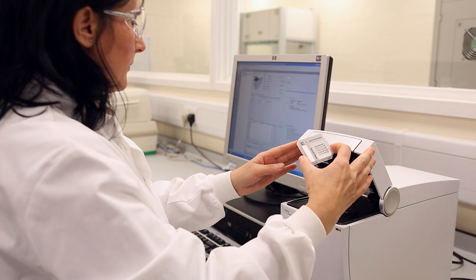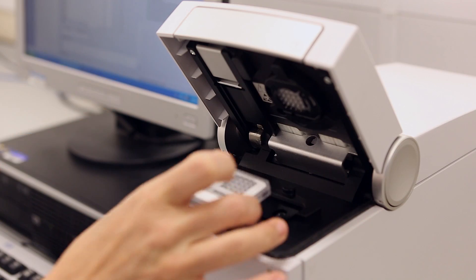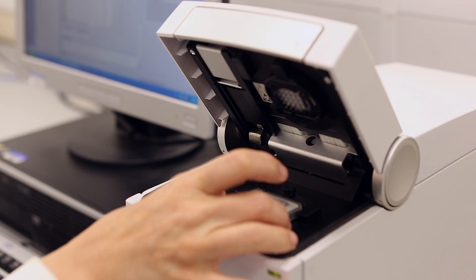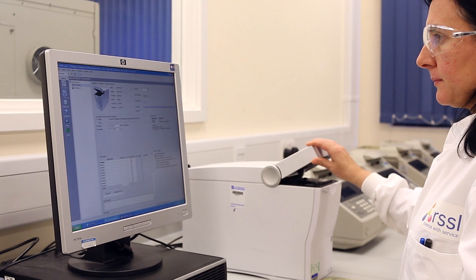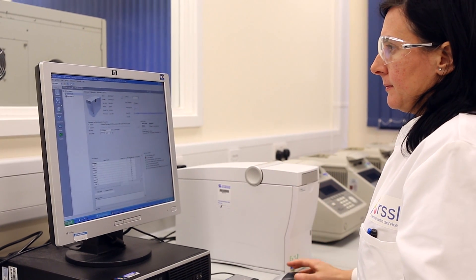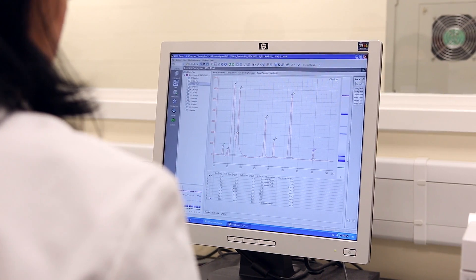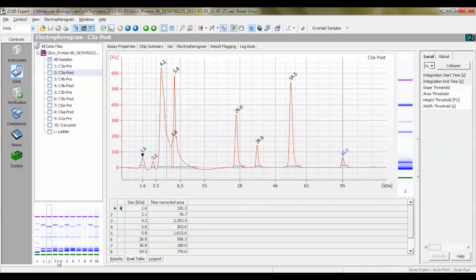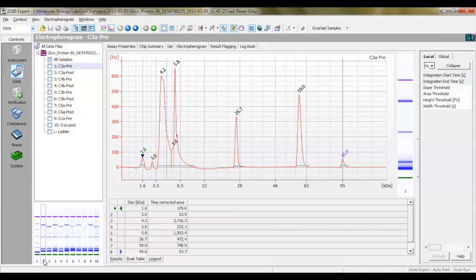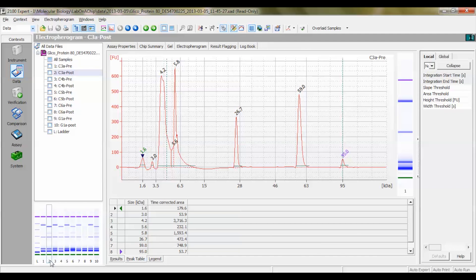The issue of protein purity may be addressed by molecular weight-based separation techniques. Here, the results pre- and post-enzymatic carbohydrate removal are displayed following separation. Only the heavy and light chain bands, and no other protein contaminants, can be seen in the antibody alone sample.